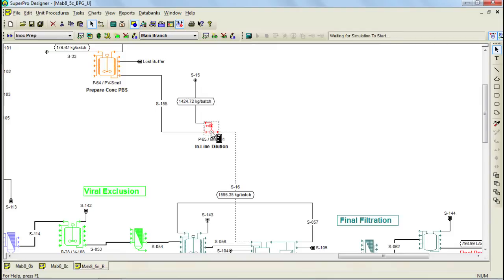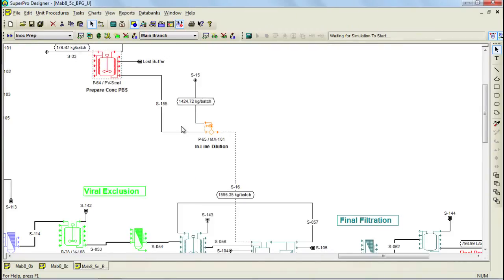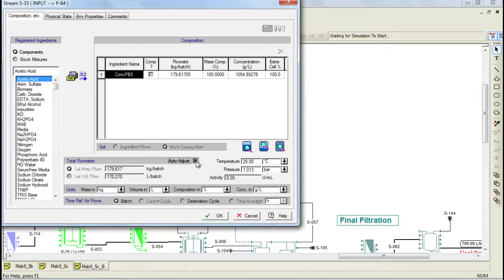To have the program perform backpropagation, there are a couple of things you need to do. First, in the charge operation of the buffer procedure, you need to select the option 'use amount on stream' instead of choosing 'set by user' and specifying a given amount. Secondly, you need to bring up the input streams dialog to select the 'auto adjust' option for that stream. This can be done either by clicking on the test-tube button on the operating conditions tab of the charge operation, or by double-clicking on the stream line itself. The auto adjust option can be specified by checking this box, which allows the program to auto-adjust the amount of input material as backpropagated from another procedure.